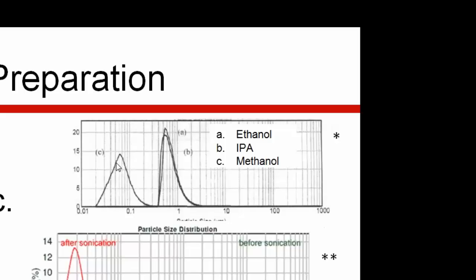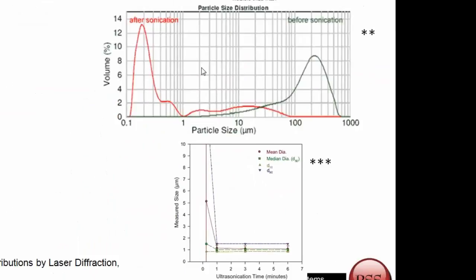If you just see results and someone says, I measured it in alcohol, that alone isn't enough information to understand how the sample was prepared, in order to ever compare the results or reproduce the same results. The next 2 results I show you are the effects of ultrasound.